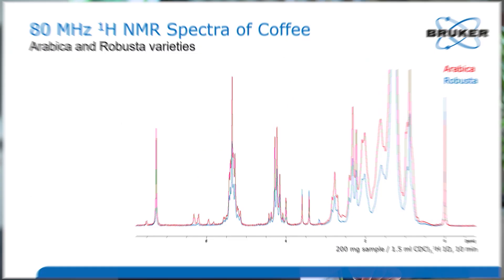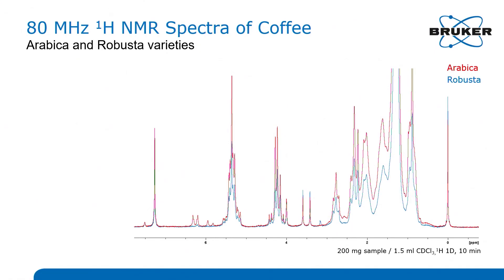So now we've got our sample — let's analyze it together. What you see here is the spectrum of the sample that we just acquired, shown in blue. This was a robusta variety.